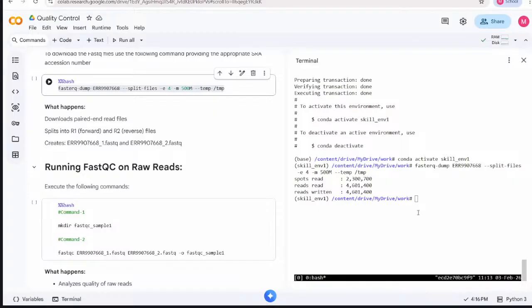I might not know that much, but what happens when we execute a command is that it occupies a single core if we execute the command without specifying threads.